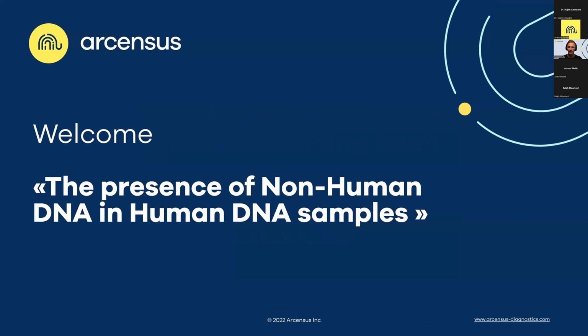We have 45 exciting minutes ahead of us with this wonderful topic of the presence of non-human DNA in human DNA samples. So what we basically want to talk about is what else than human DNA do we find on the buccal swabs when we do our analysis. We have a very experienced speaker with us, so we'll introduce them to you and guide you through these slides.